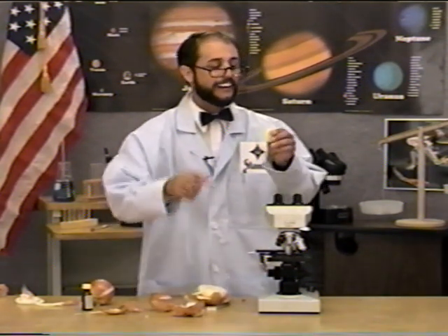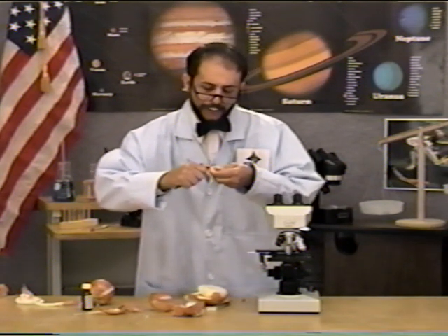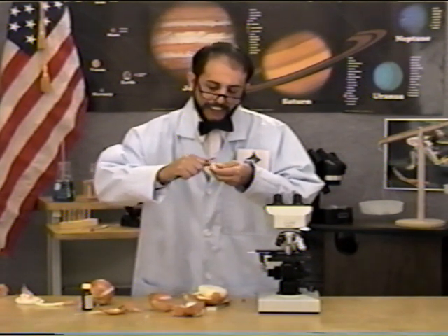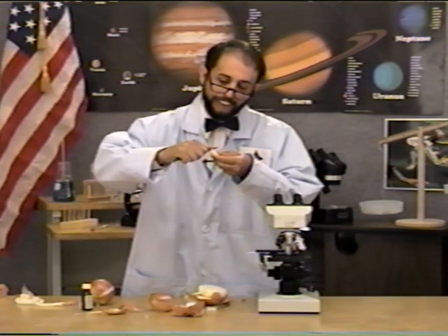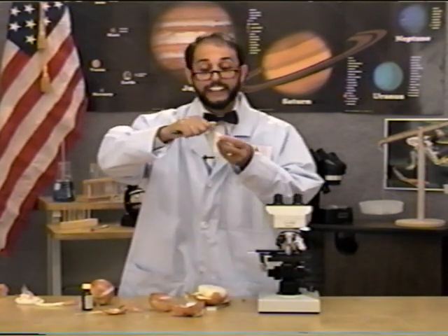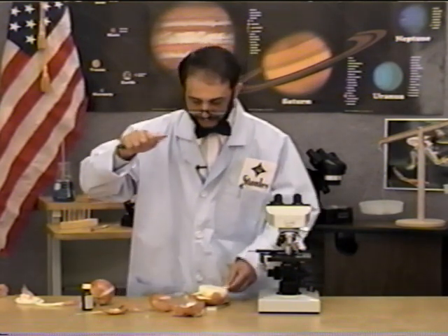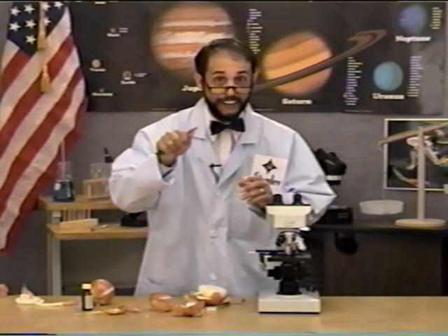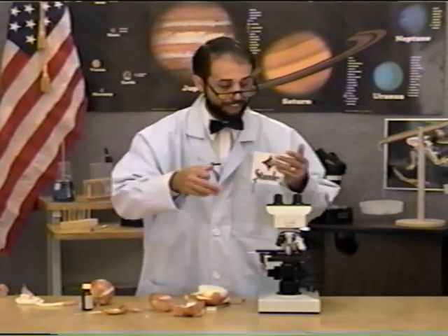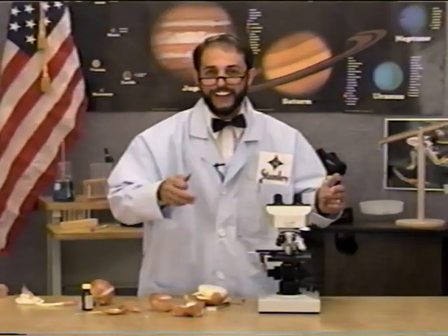And if you take a knife or something sharp and peel very carefully on the outside edge, you can usually lift, there we go, a very small tissue-thin piece of the bulb that you can then transfer to a slide and stain with iodine, put a cover slip on, and put it in the microscope and observe. We'll do that here.